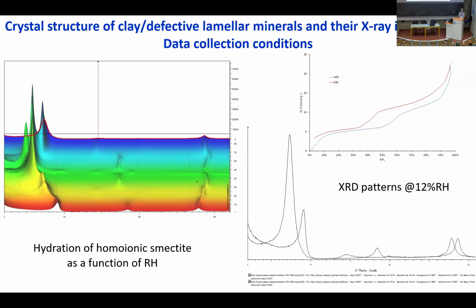Obviously, this is when you start to want to make some accurate estimate of whether there is any evolution of my sample because I exposed it to this molecule or to this condition or to something specific. In this case, clearly, if you measure one sample in this condition and the other one in that condition, the change has been huge. I'm just not measuring it in the same conditions.